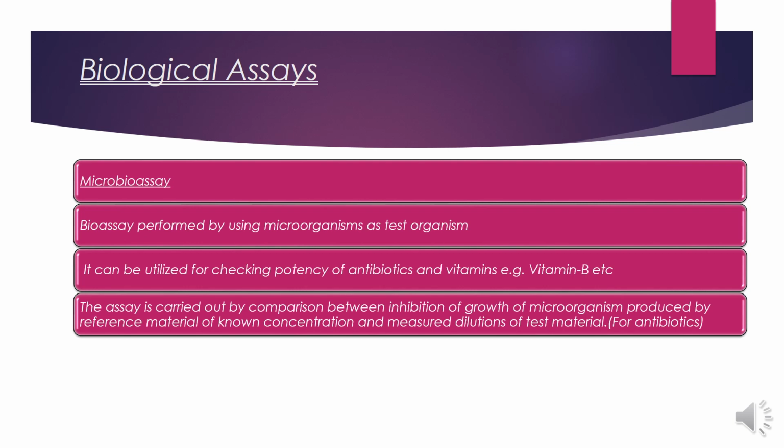The assay basically is carried out by comparison between inhibition of growth of microorganism produced by the reference material of known concentration, and measured dilution of test material.